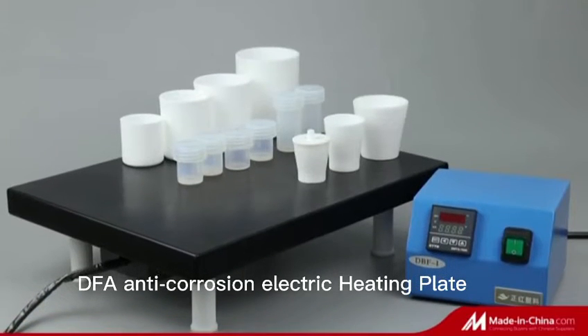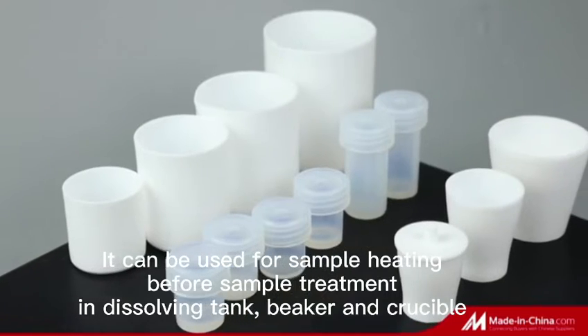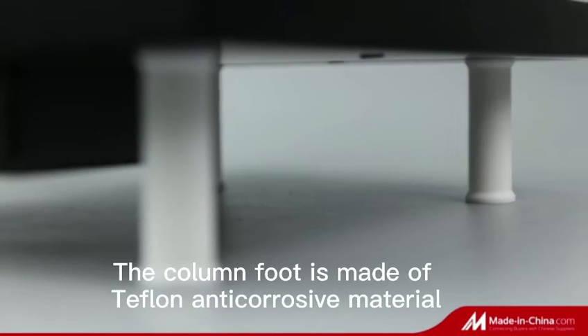Nanjing Bingzheng Hong Instrument Company Limited is a manufacturer specializing in the development, customization, and sales of high-quality Teflon laboratory utensils and analytical instruments.